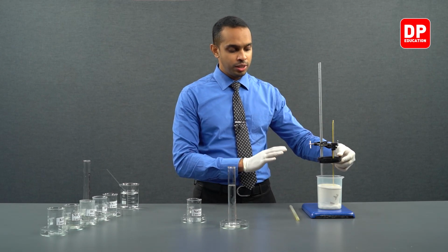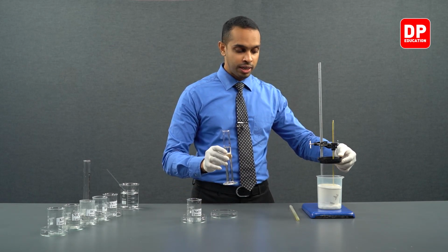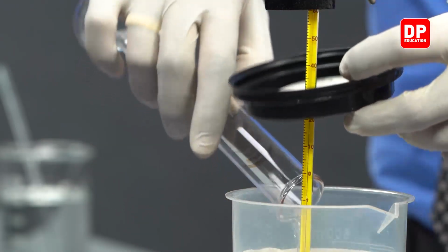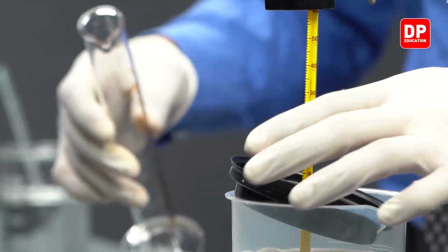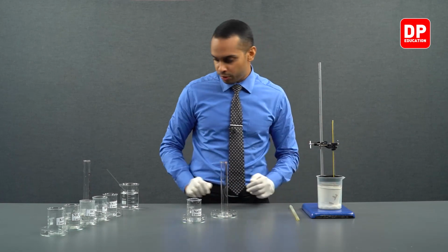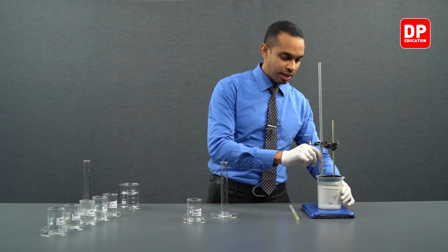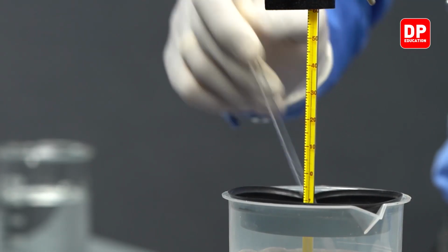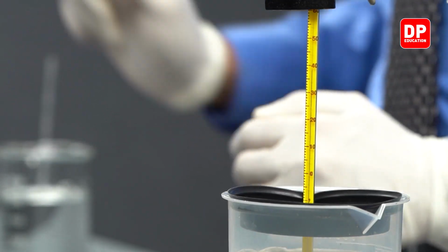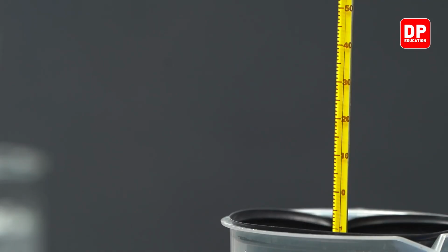After getting ready to close the lid, we are going to be adding our sodium hydroxide to this acetic acid we have in the beaker. As soon as it is added, we are going to close the lid like so and take the temperature reading. We can mix the reaction mixture as well. And we are going to measure the highest temperature that this reaction mixture is going to reach.